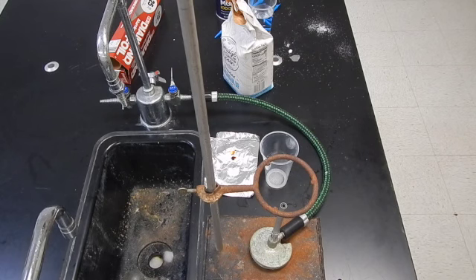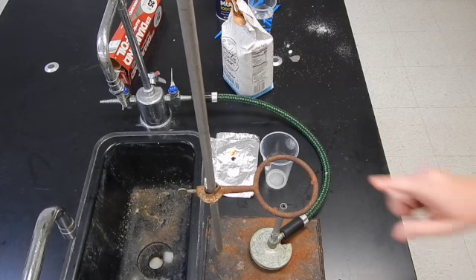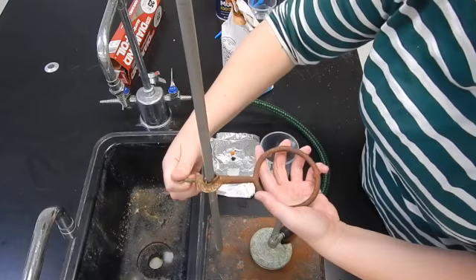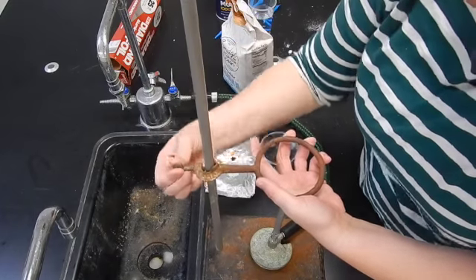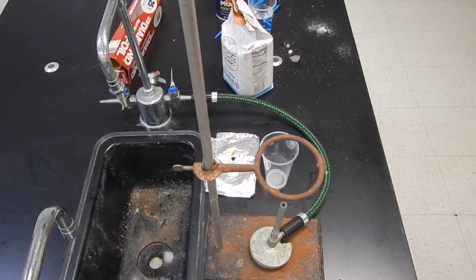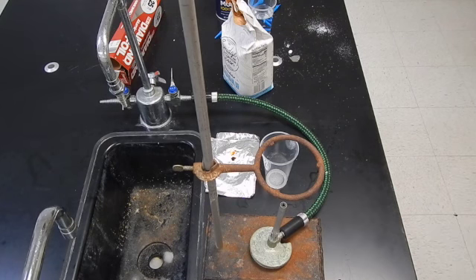Alright, so step 1, I cut a piece of aluminum foil that is big enough to fit on the ring stand. We are going to set the ring stand up with the iron ring attached, just like this. I'm going to move it up just a little bit so it's not as close to the flame, because you want it to be about 3 to 4 inches above where the flame's going to be, so it's not directly catching on fire.